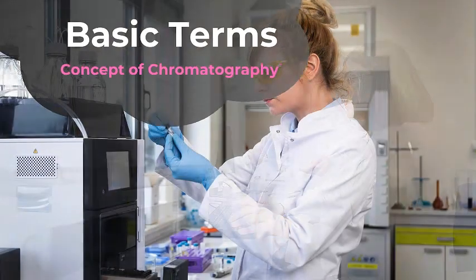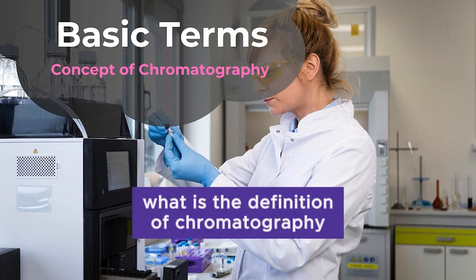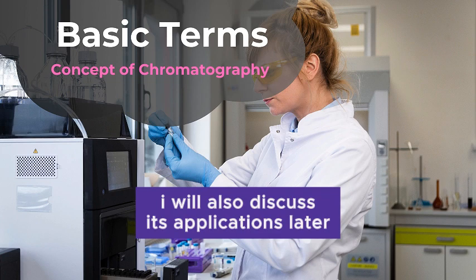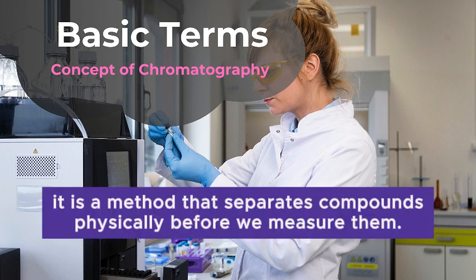I would like to explain that we want to define chromatography at the beginning. What is the definition of chromatography? I will also discuss its applications later. In fact, if we want to have a complete and clear definition of chromatography, it is a method that separates compounds physically before we measure them.